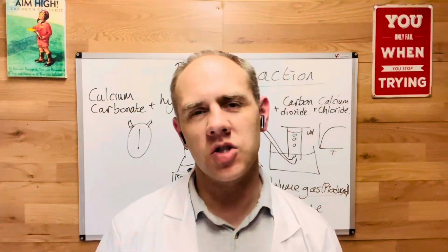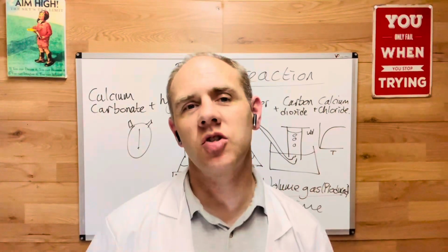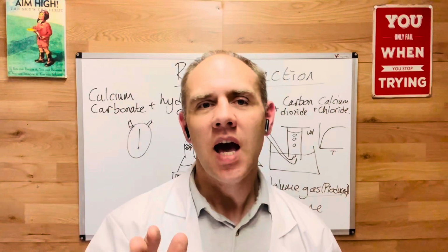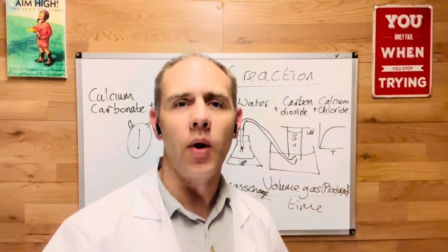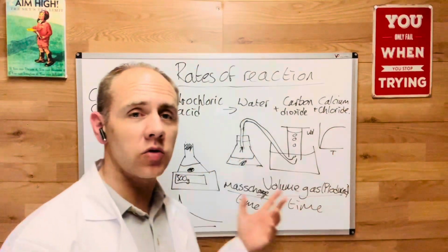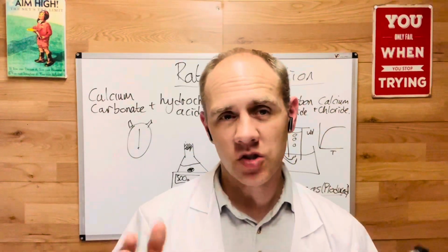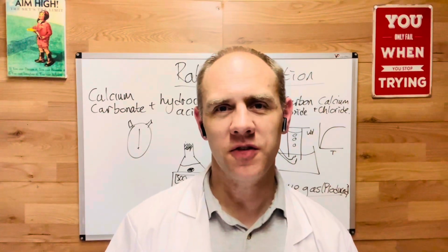There's more videos knocking around on the net that will allow you to see this taking place. I've just done a quick pair of them, which you can see how you would measure the rate of the reaction as a gas being produced, so a product is produced or a product is lost. In this case, it's the same gas, carbon dioxide. There's lots of different ways you can do this. That's the main one for today.